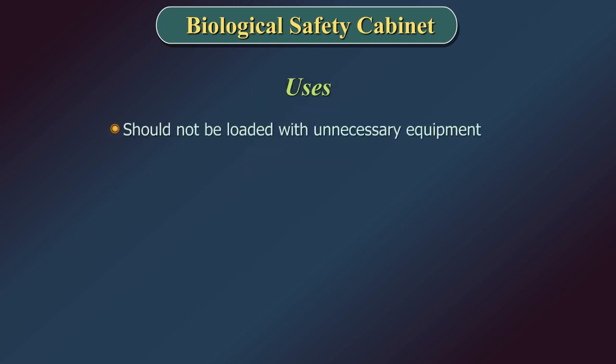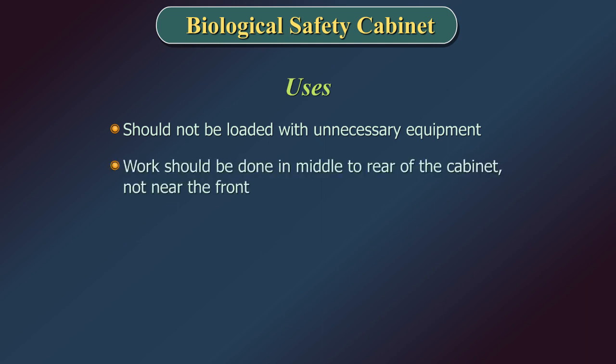A safety cabinet should not be loaded with unnecessary equipment, or it will not carry out its job properly. Work should be done in the middle to rear of the cabinet, not near the front.